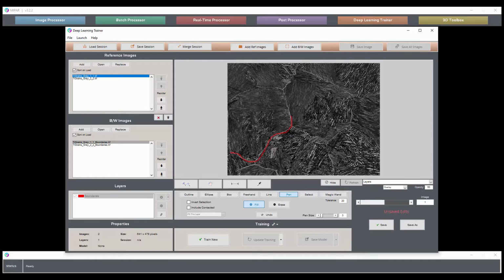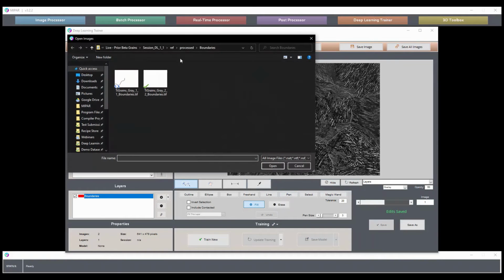But what we actually did in this case was drop these images over to an iPad and use any of the number of tracing apps that are available. You can use the built-in markup application. We use an application called Procreate that we like. And it's a very natural, much more enjoyable experience with the Apple Pencil and the iPad tech these days to just do your annotations on something like that, and then you can import those right over into the training environment. So what I'll actually do is just go grab those tracings that we've made.